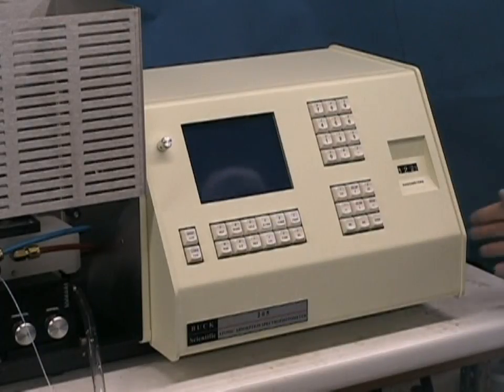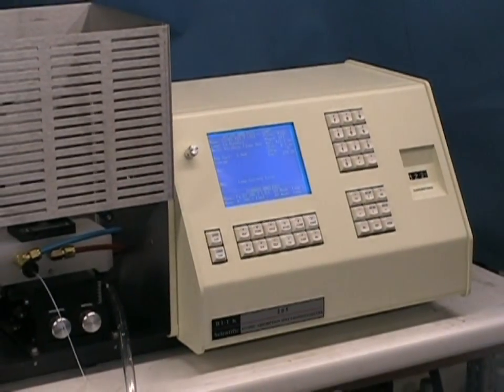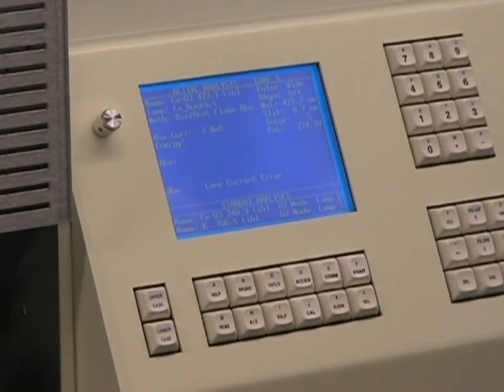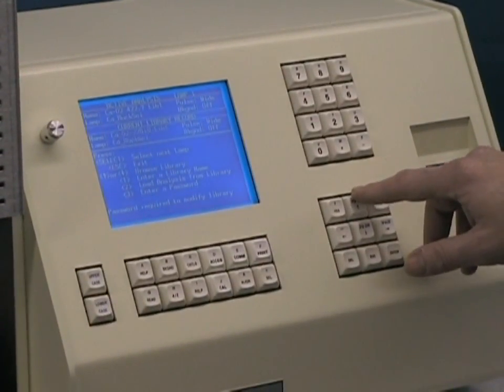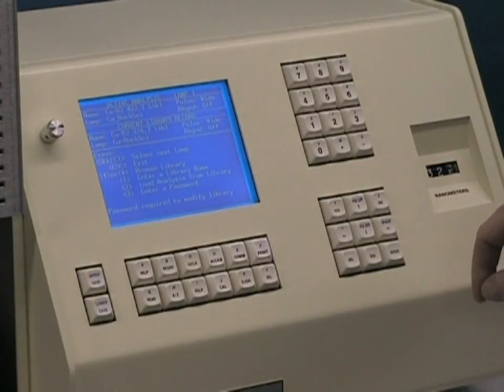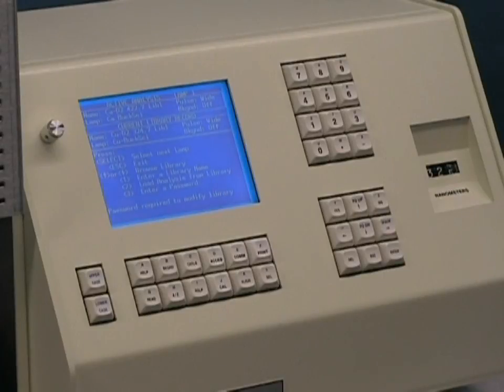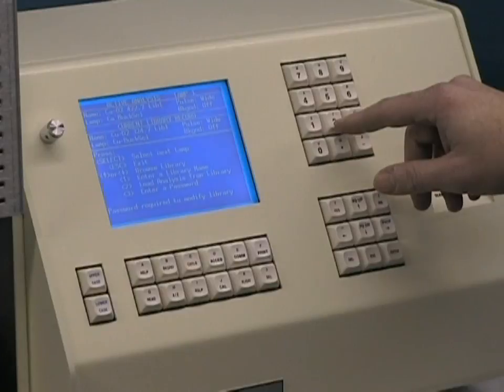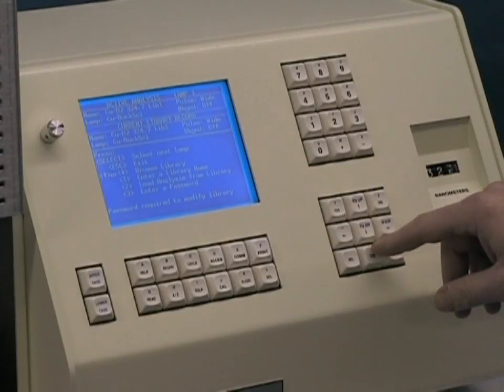Turn on the instrument by pressing the power button on the right side panel of the unit. Like any microprocessor-based system, wait a few moments for it to initialize and set itself up for display. The system displays the active analysis window which is where all of your analytical information will be seen. To set up for an analysis, press the select key which will enter you into the library mode. Using the up and down arrows, select the elements you want for this particular lamp. Notice in the upper right corner of the display there's a lamp designation: lamp 1, lamp 2, and lamp 3. Make sure the proper lamp is loaded with the hollow cathode lamp based on the file you select in the library. In this case we're selecting copper for flame work. Pressing 2 and enter replaces the previous file, which was calcium, with copper, and you can see that in the upper line of the display. Once this is done, press escape.